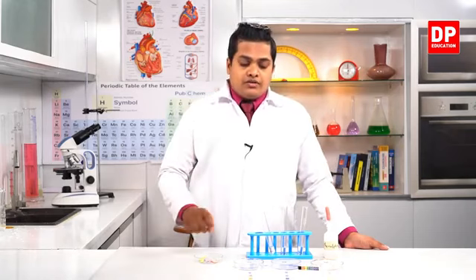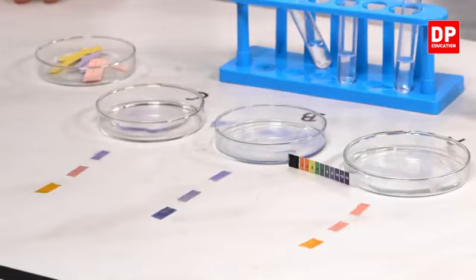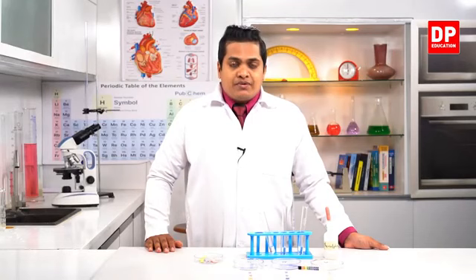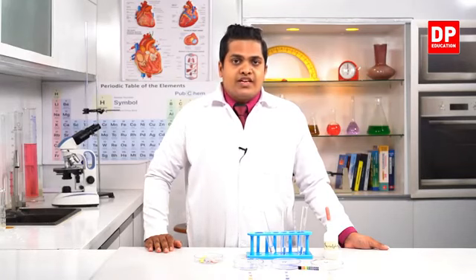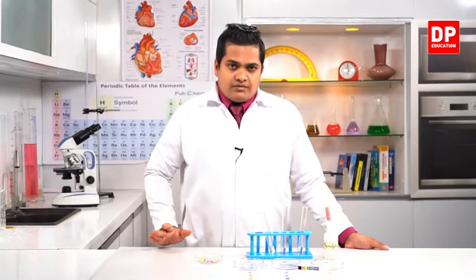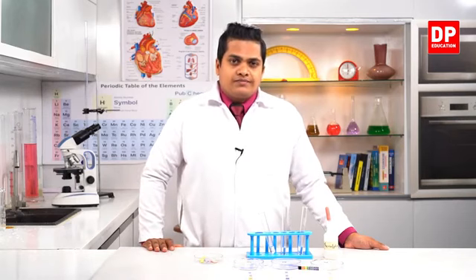Now the third one, the neutral substance. There is no distinct change when you add these papers to neutral substances. Red litmus remains red, blue litmus remains blue, and the pH paper shows some color related to pH value 6, 7, greater than 5 but closer to 6 and 7, right?